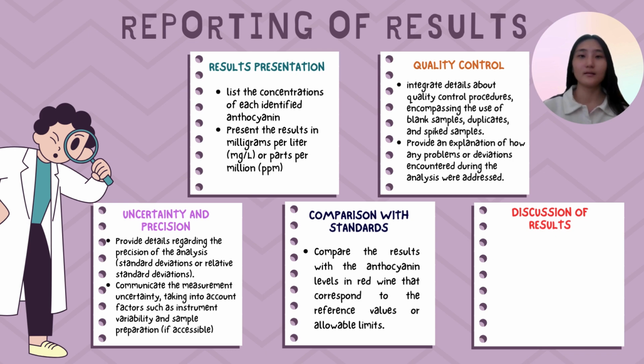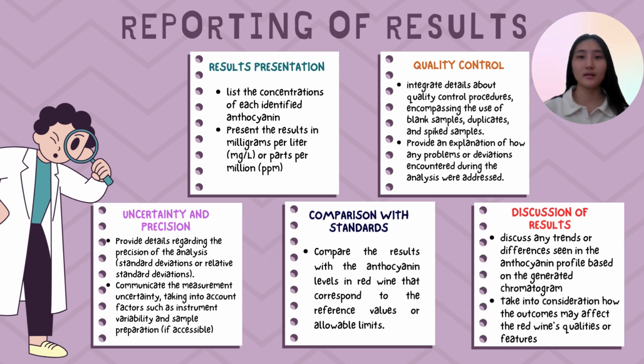Last one is discussion of results. Discuss any trends or patterns seen in the anthocyanin profile based on the generated chromatogram. It's also important to take into consideration how the outcomes may affect the red wine's quality or features.